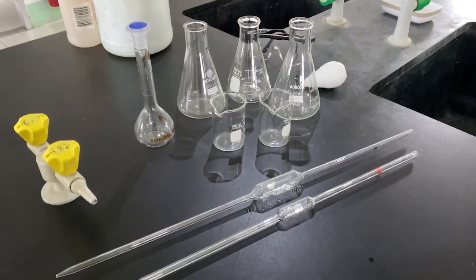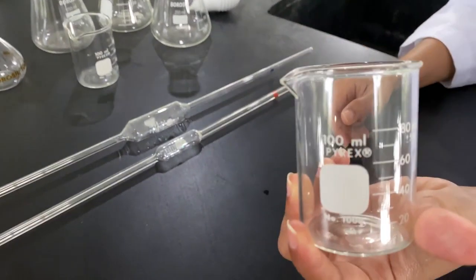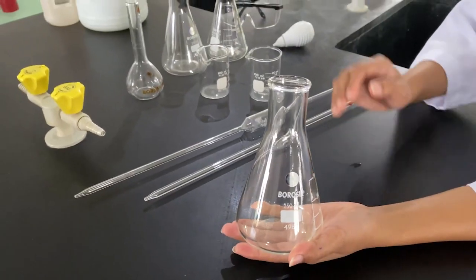Before we begin the procedure, let me acquaint you with the basic glassware involved, not only in the procedure itself, but also in the preparation of the solutions needed.